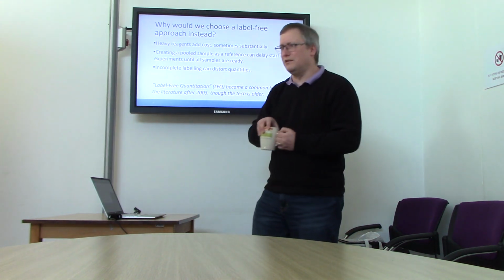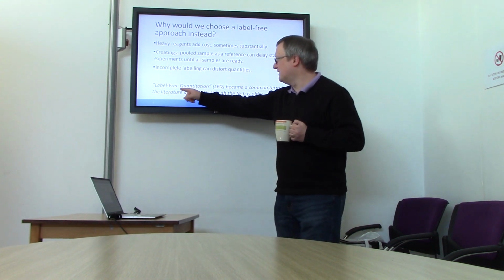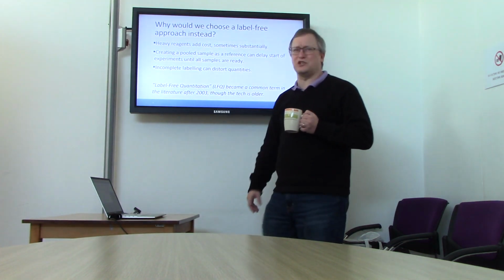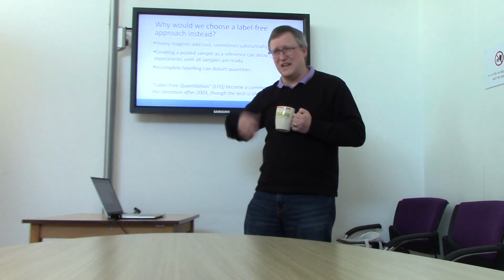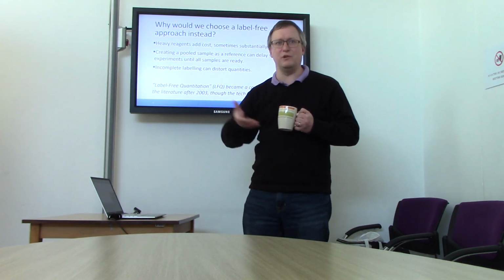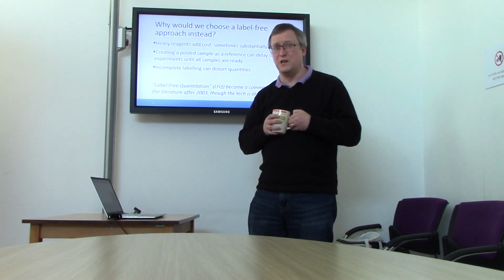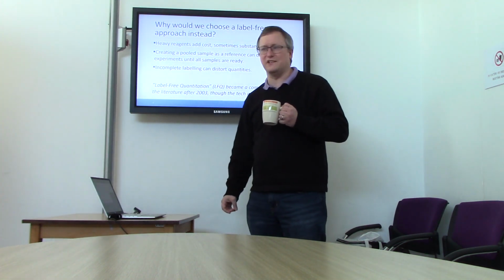I would note that although label-free quantitation has been around for quite a while, the phrase label-free quantitation really started showing up around 2003. So people have been doing spectral counting and intensity assessment through extracted ion chromatograms for a long time. But this term, the moniker label-free quant, is actually a fairly late addition.